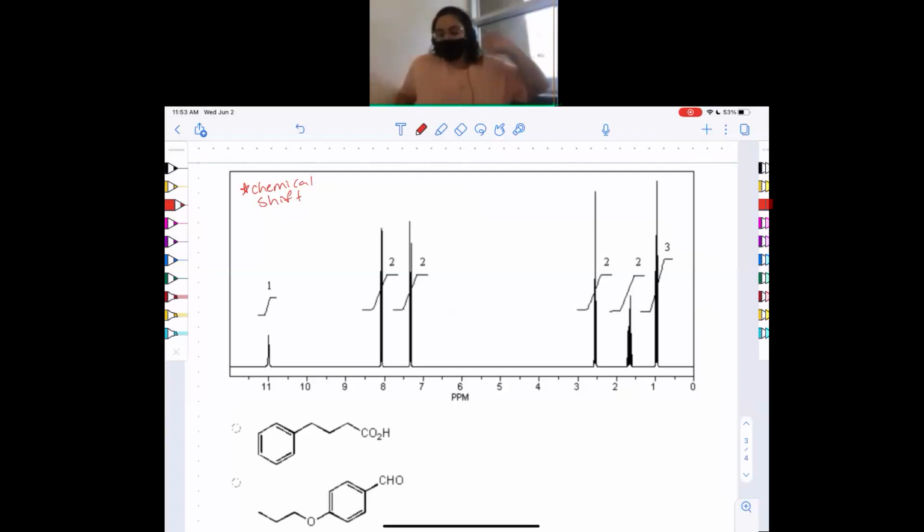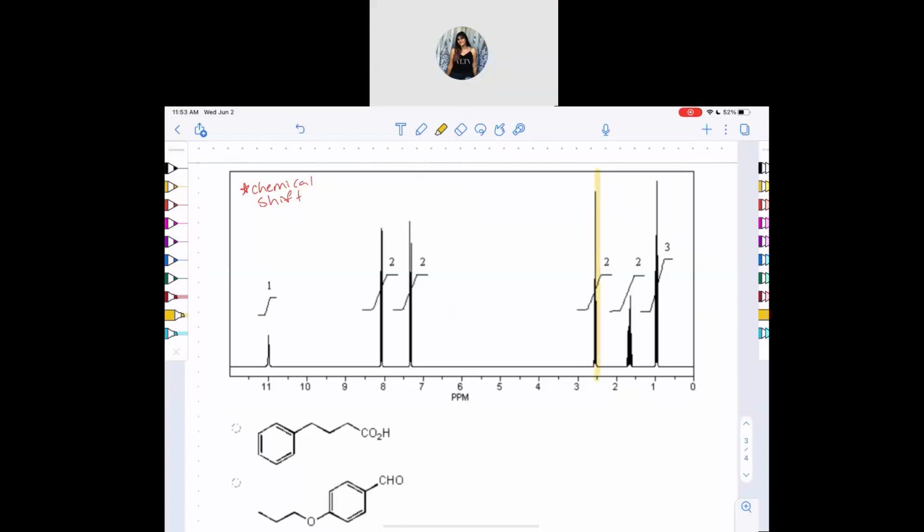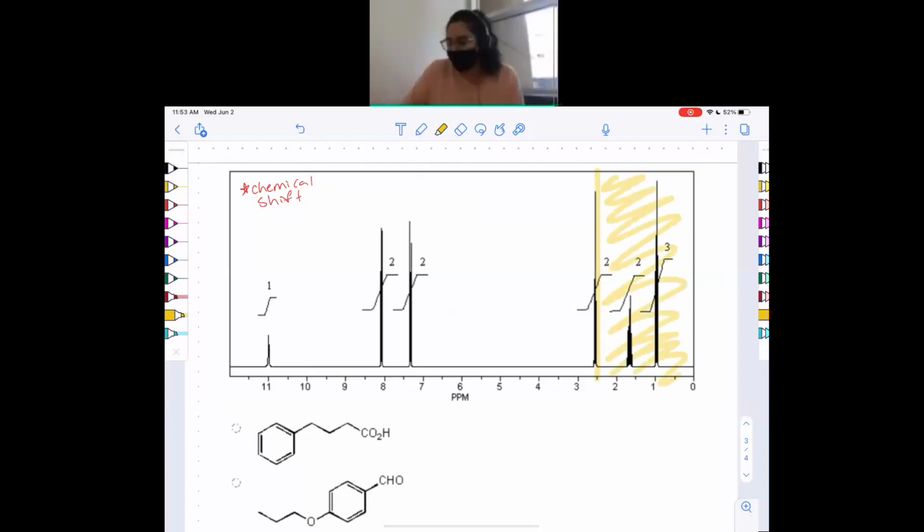Cool. So what I mean by chemical shift is I just quickly go in and cut up the regions. This one pretty much goes up to 12, so all the regions are present. What's our first chemical shift region? The first one's like the alkyls. Alkyl or aliphatic. So where does that one end? That one's 1 to 2, isn't it? 2.5, yeah. All of this is alkyl.